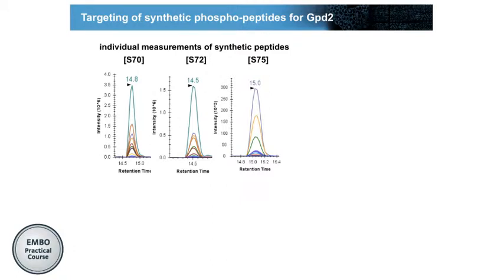We go back to the peptides that we had before. We had these 3 options, and here we have 3 heavy peptides. Each one of them was spiked separately, and we scan through the B and Y ions. You can already appreciate that the peaks look somehow different. So you can say just by eye that there are different relative intensities, and maybe these are not exactly the same. So you would say, well, I can try and guess which one.